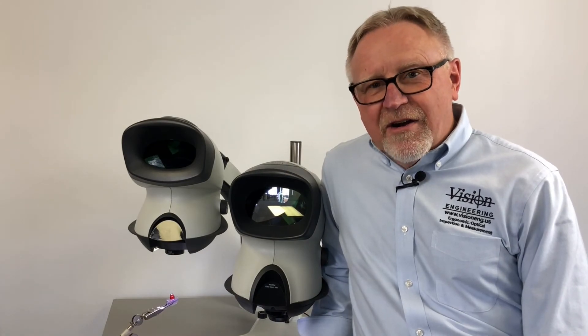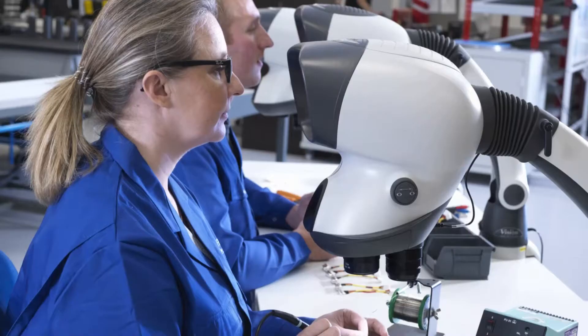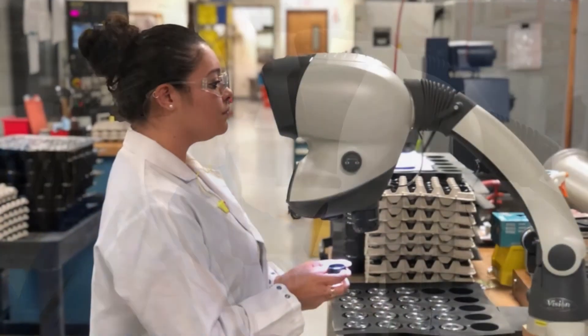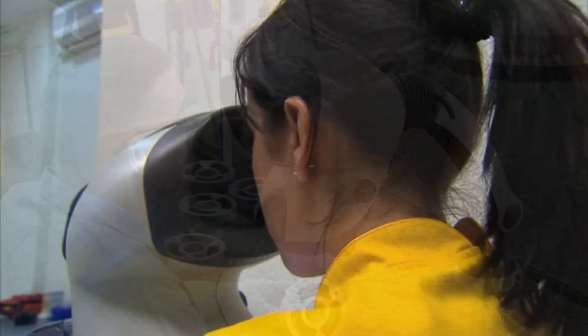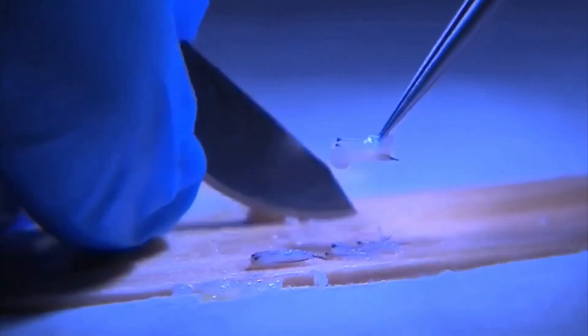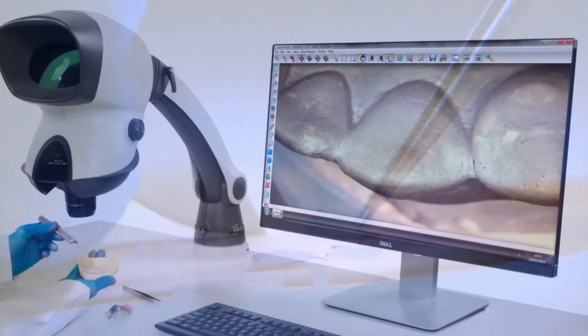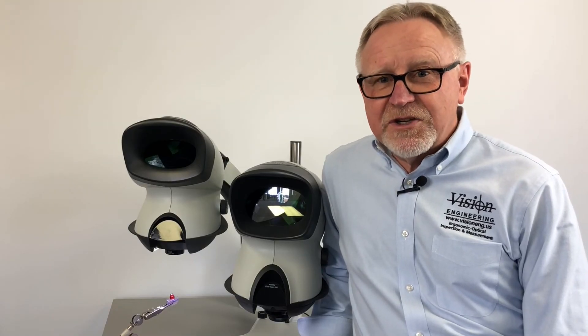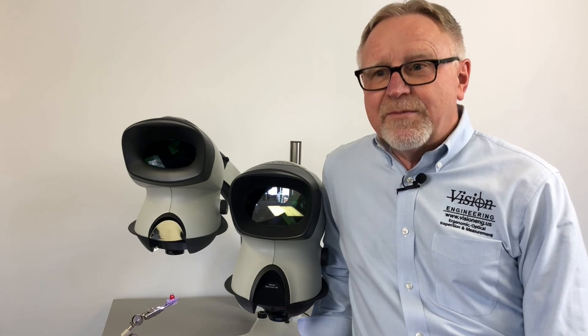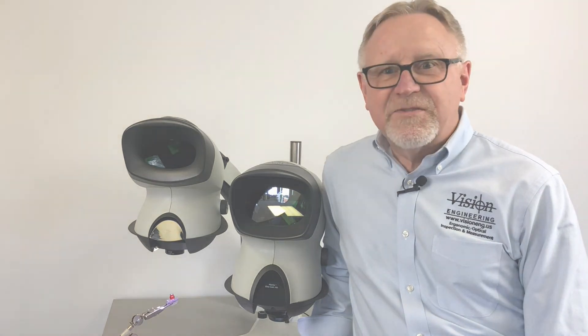Applications for the Mantis are as varied as your imagination. We have systems being used in assembly, rework, deburring, dental, hair transplant, medical manufacturing, jewelry — literally as varied as your imagination. Wherever you need magnification, high resolution, and bright images, Mantis is for you.